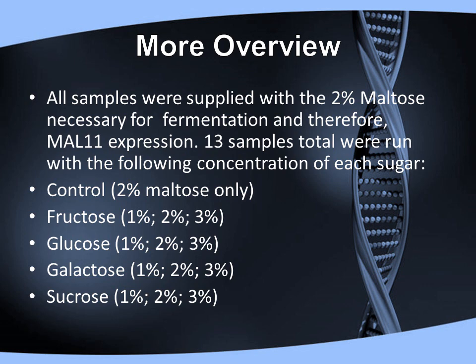2% maltose was also introduced into each of the following samples. Fructose 1, 2, and 3%, glucose 1, 2, and 3%, galactose 1, 2, and 3%, and sucrose 1, 2, and 3%.